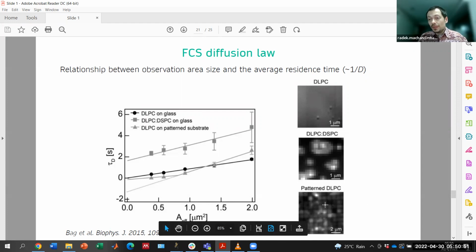the spacing of these barriers is large enough to be resolved in the image, and so we can see here the transition of the two regimes, the free diffusion within one of the corrals, and then the slower diffusion when the particle needs to cross the barriers. This results in the negative offset.